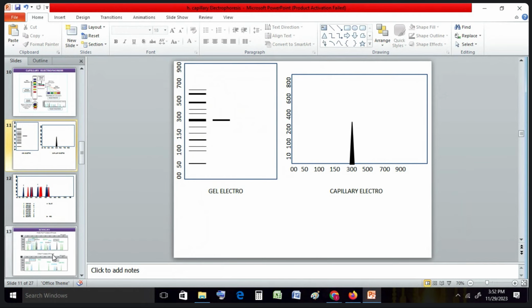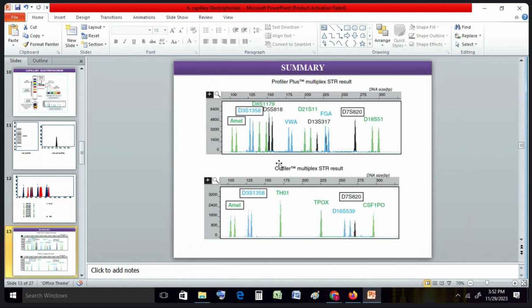Just for example, let's look at these pictures. Take this one: you can see this is a locus result, ML, just another locus name. You are seeing two peaks. What would this ML result be, heterozygous or homozygous? Sir, heterozygous. Obviously true.